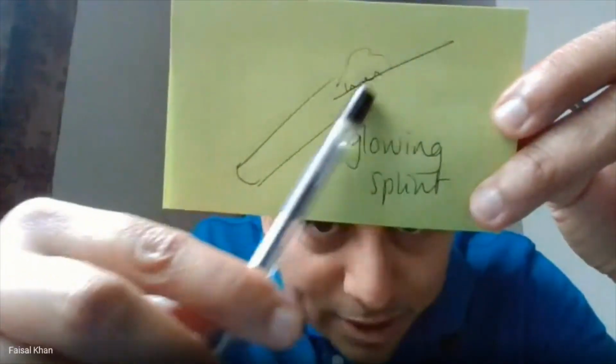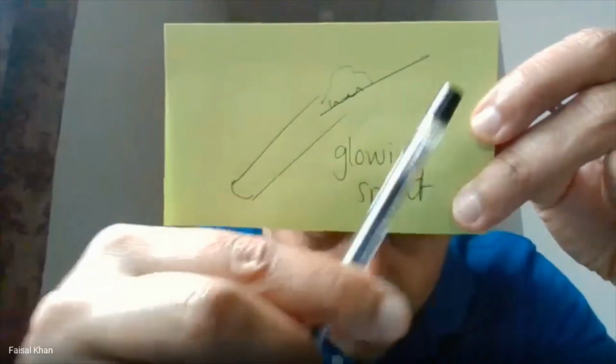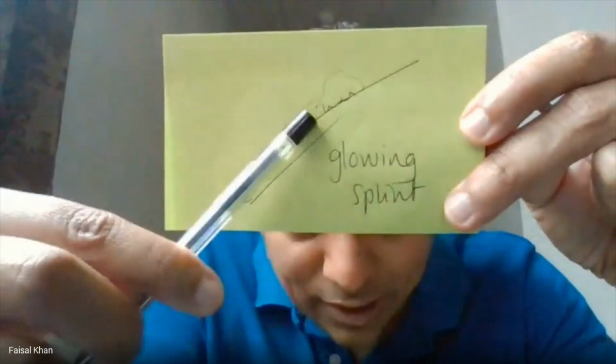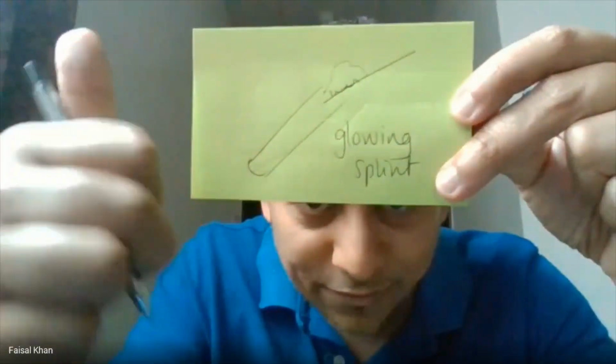Glowing splint. So this would be a splint, it would be glowing, and then what you would do is insert it into the test tube and it would relight. Okay, so that would be a positive test for oxygen.